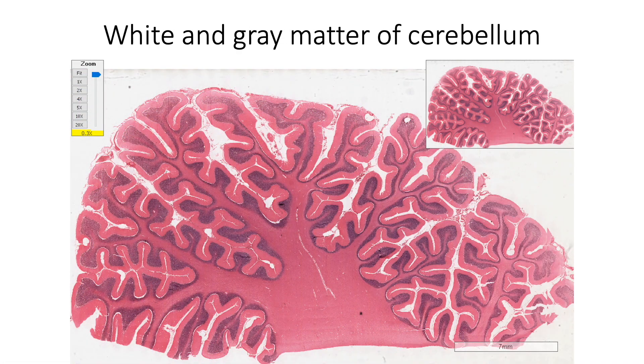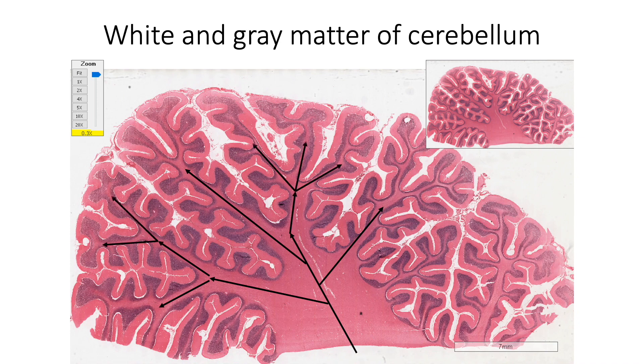Central core of white matter of the cerebellum divides like branches of a tree described as arbor vitae cerebelli. The white matter contains both ascending and descending fibers to and from the cortex. In addition, we find neuroglial cells and blood vessels. Buried in the depth of white matter, we also find four pairs of intracerebellar nuclei. However, those nuclei are not seen in this section.